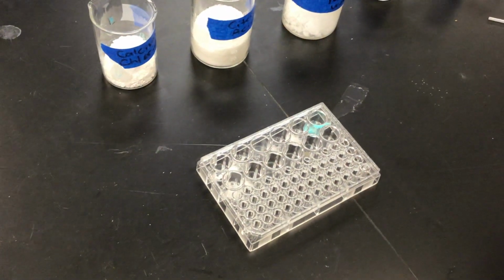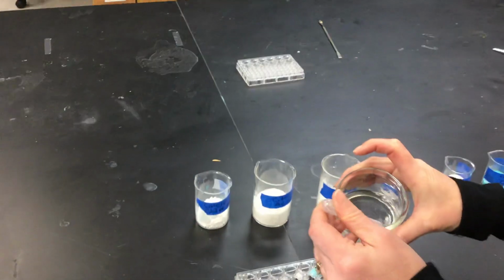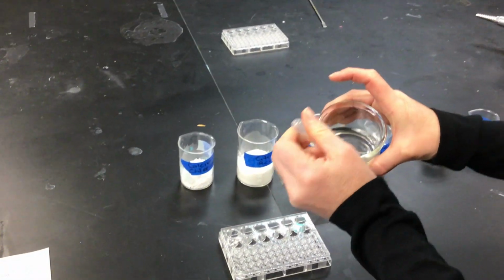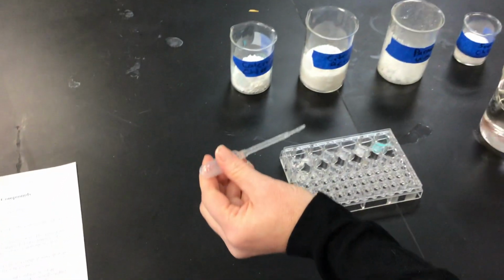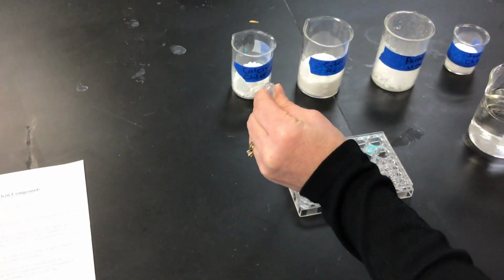Okay. Now what I'm going to do is I'm going to get a pipette of distilled water, and I'm going to put drops, and I'm going to go ahead and do this, and then we're going to come back and look to see whether or not it dissolved.